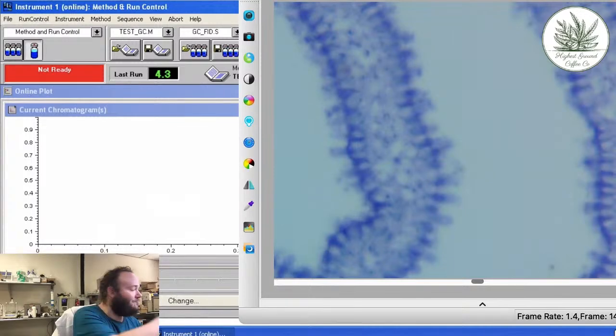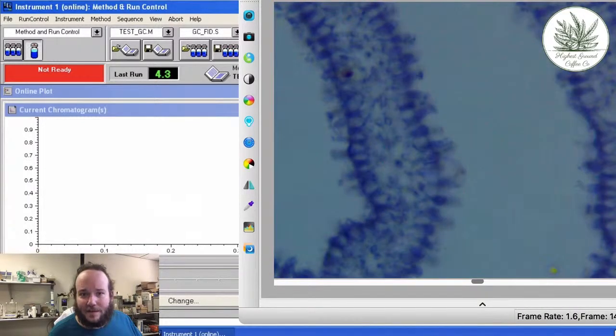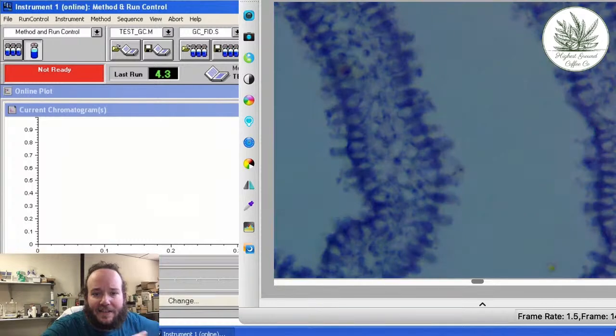All right, that's probably as focused as I can get. Bump up the contrast here. It's kind of cool, right? Because it kind of looks like cannabis in the sense that it has trichomes coming out of it, or at least it looks like trichomes. Very well, maybe the same type of structure. I'm not sure. Very neat.